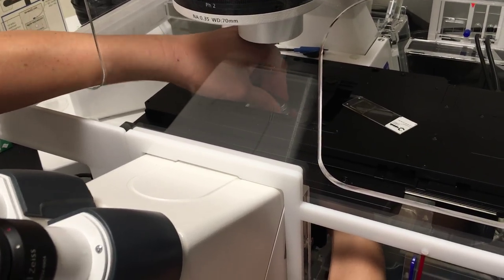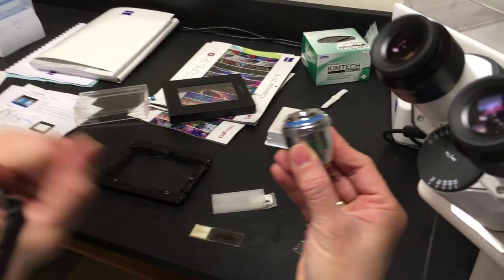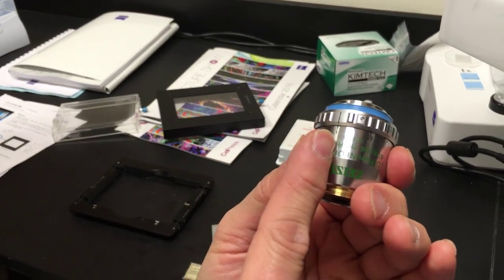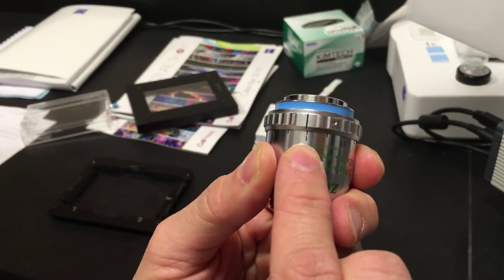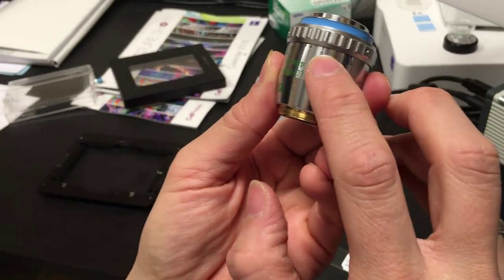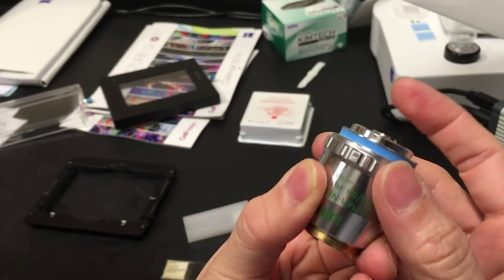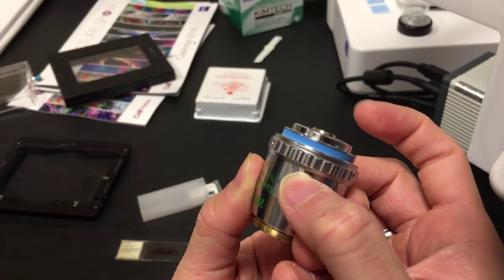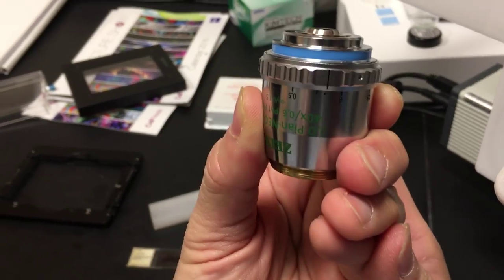Since most of your work will be based on dishes or plates—they're on average 1mm thick—we will want to have the correction collar ring set to 1. You can see it goes from 0 to 1.5. The little dot here is 0.17, which means if you want to do a coverslip, you can go there and now it's coverslip corrected.